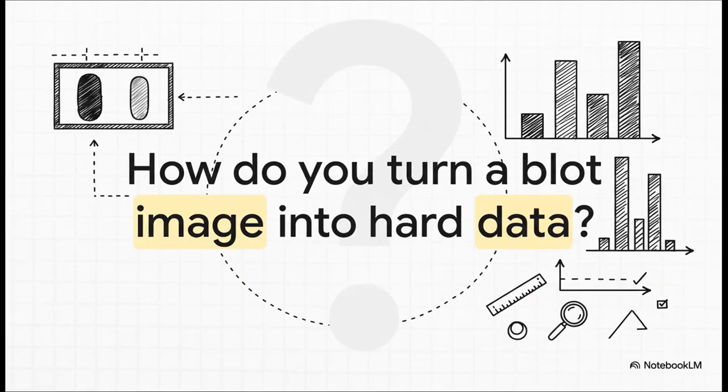So you're looking at your blot, right? And you can clearly see that one band looks a little fainter than the other. But is that really enough to publish a paper or draw a firm conclusion? Not quite. The real trick, and what we're going to solve right now, is how to move from that gut feeling, that visual hunch, to a solid, objective number that will stand up to any scrutiny.